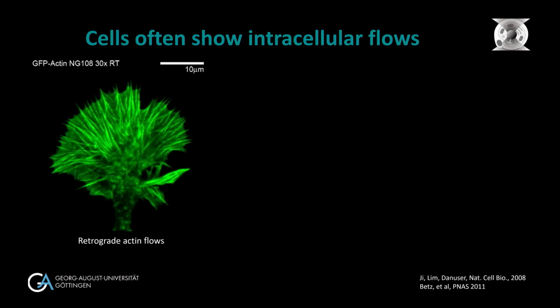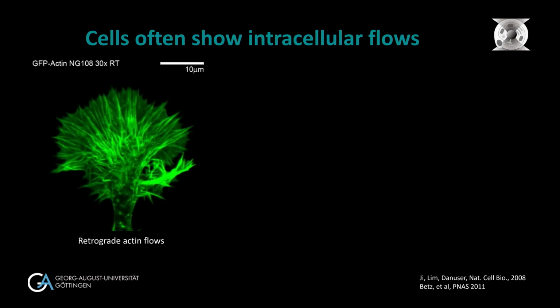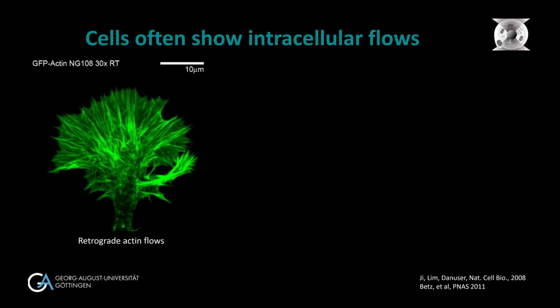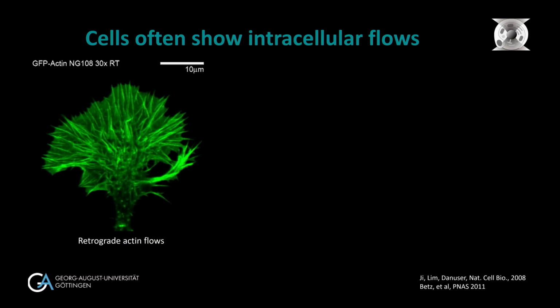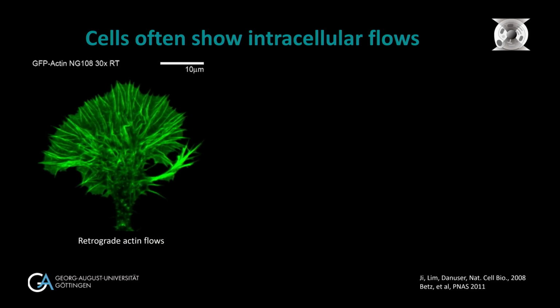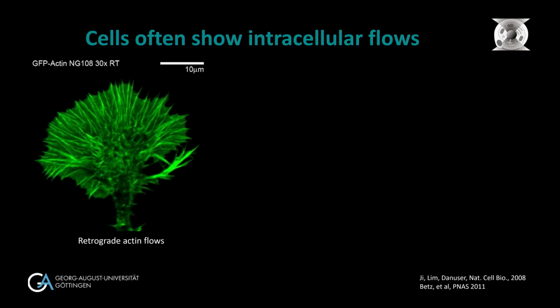We can now look at a confocal microscope image here. This is the lamellipodia, and you see there's this beautiful kind of flow. Now you can ask yourself the question whether there is any chance to get out of these flows that we see here, because that's just a deformation, can we learn something about force generation in these systems?